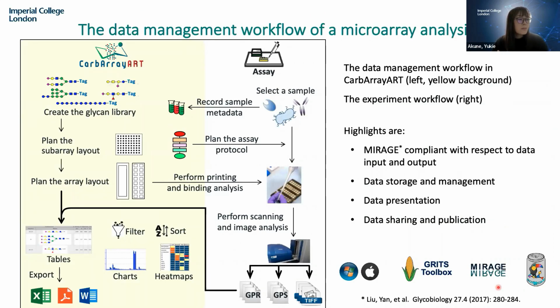This is the data management workflow of the microarray analysis. The left side in yellow background is the workflow in CarbArrayART, and the right side is the workflow in array experiment. CarbArrayART is MIRAGE compliant software, for data storage.